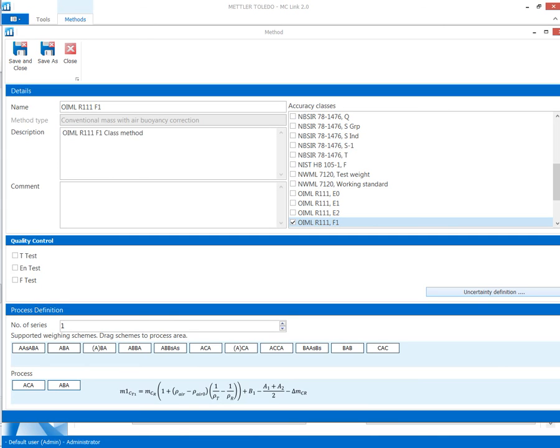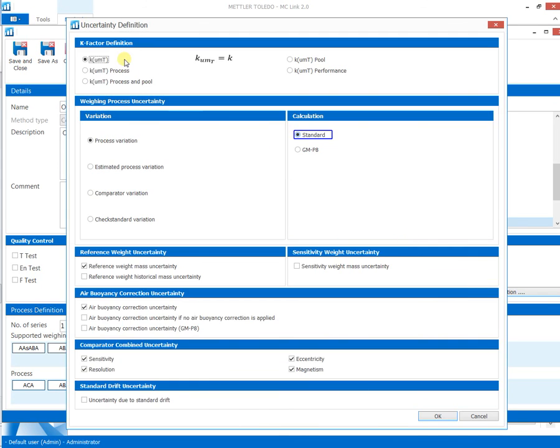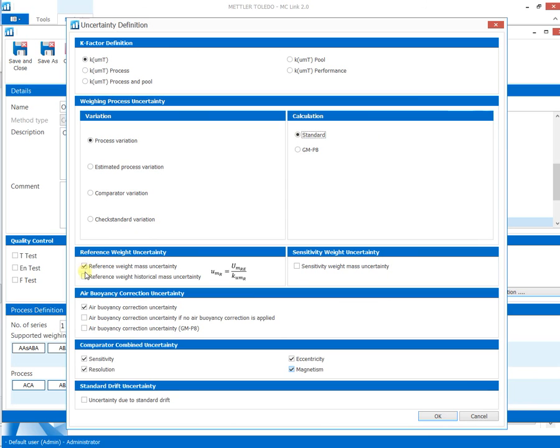For the uncertainty analysis, all contribution factors according to international regulations are available for simple selection. Any combination is selectable.